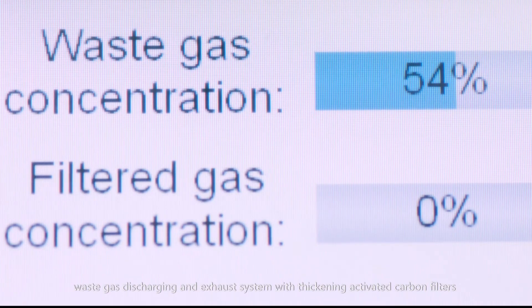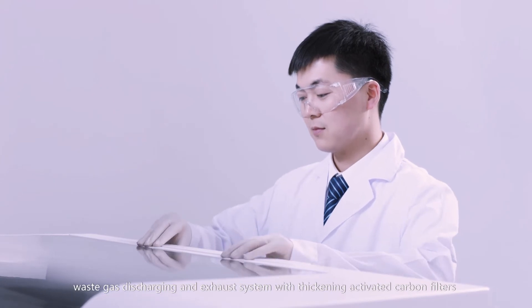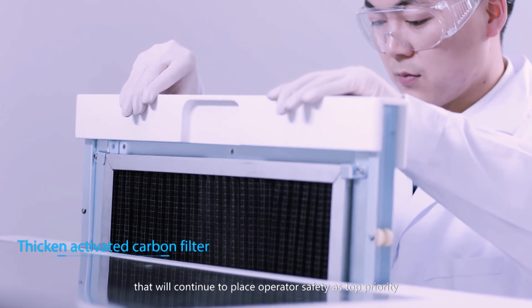The DP-260 has a fully enclosed design, waste gas discharging and exhaust system with thickening activated carbon filters that will continue to place operator safety as top priority.